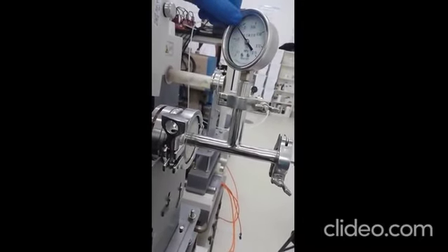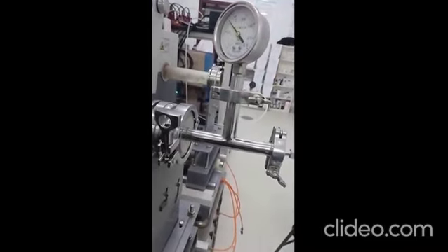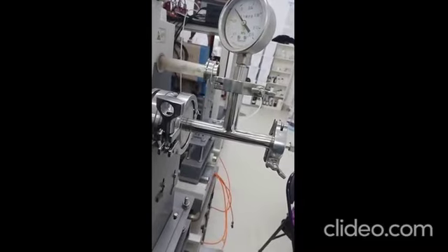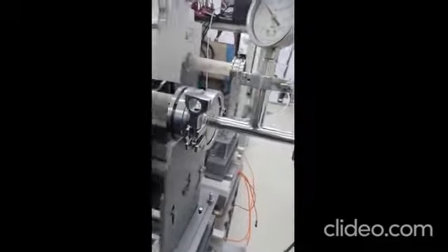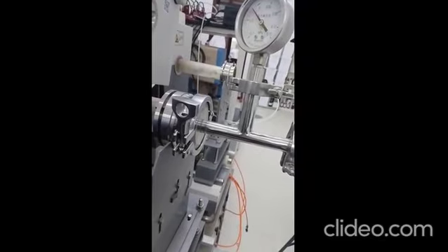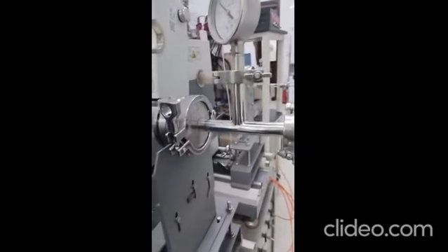This is pressure inside this? Air. 0 means pressure in air. This is 0, minus 0. Yes, it's compared with air pressure. It's minus. Oh, okay. So this is 0 Pascal in fact. So you can see.